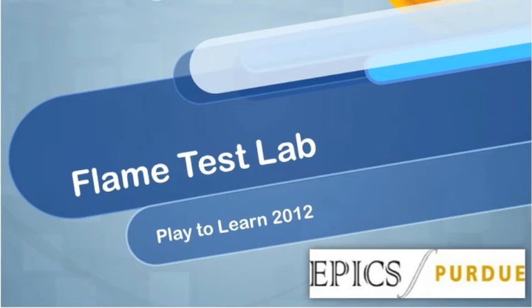We are the Play to Learn chemistry team from Purdue University's EPICS program. We will be demonstrating a flame test lab that was originally intended for use at Jefferson High School in Lafayette, Indiana.